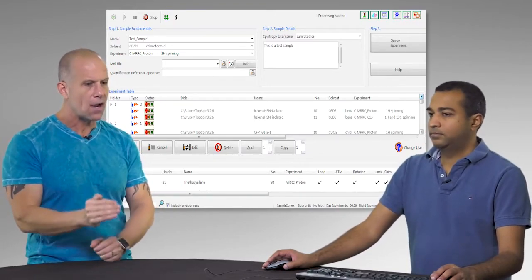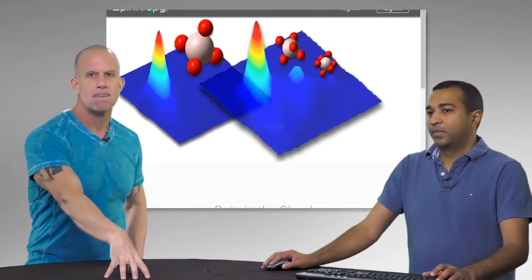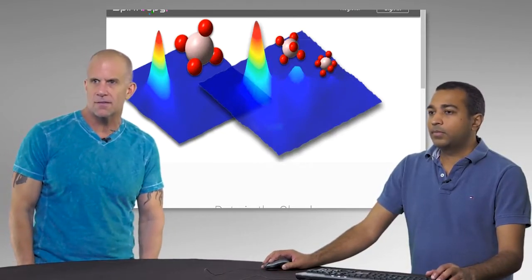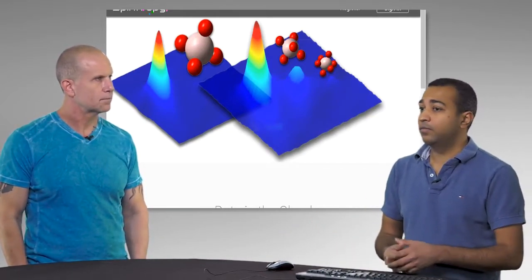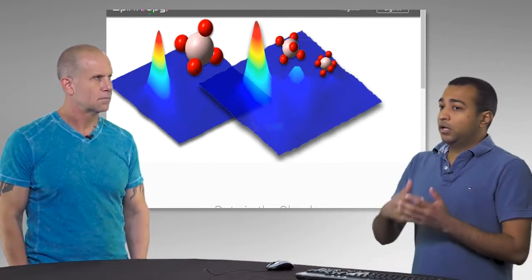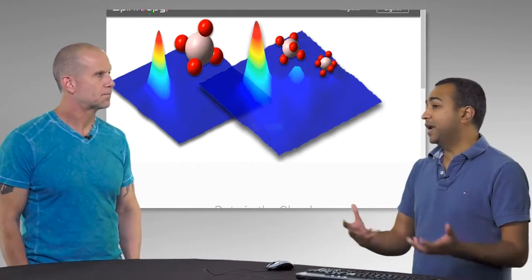So right now you have a program that on the local computers uploads that to a cloud service, right? Right. And this cloud service is Spintropy. Can you tell us a little something about this? So this is a website that was developed basically to handle NMR data and specifically automation NMR data, right? So coupled with the IconNMR interface, this really handles all the data that's coming out of that instrument.